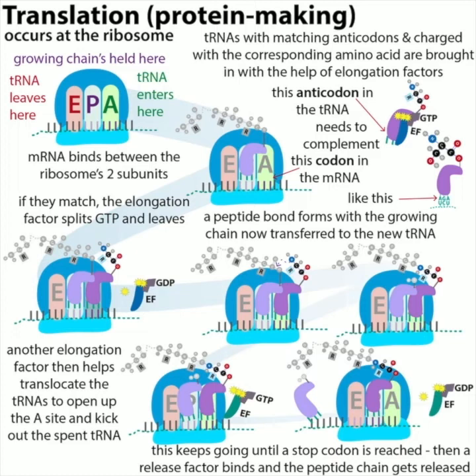The ribosome travels along the mRNA, inserting the amino acid that corresponds to the codon it stopped on. This is where you can see one end is coming out and the rest of the protein hasn't been made yet. That's where the chaperones can really play a role in helping protect those ends. And this is why if you put the fusion partner on the N terminus, it tricks the cells into making your protein.